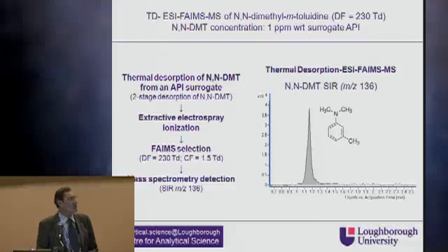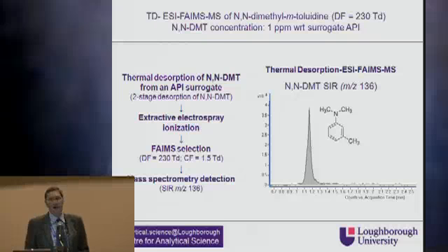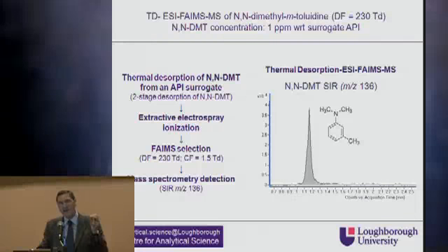This was mentioned in the previous presentation, that we can use thermal desorption of volatile species in order to extract them from their matrix. In this particular case, we take an active pharmaceutical ingredient, which may or may not have one of these PGIs present. We place it in a thermal desorption tube, and we thermally desorb it at a temperature which will remove the volatile aromatic amines, but will not desorb the basic active pharmaceutical ingredient, which will remain behind on the tube. So there's no sample preparation except to put the sample in the tube and warm it gently so that we can take off the aniline and dimethyltoluidine components.